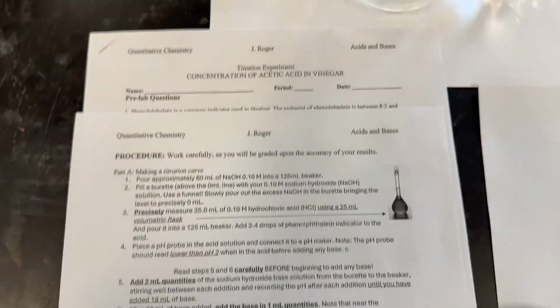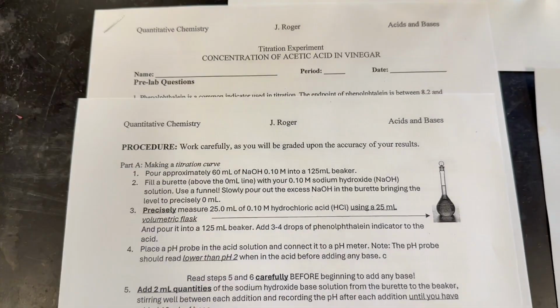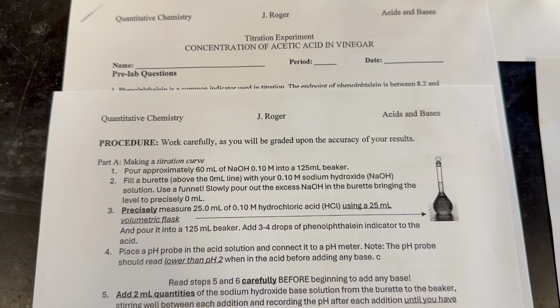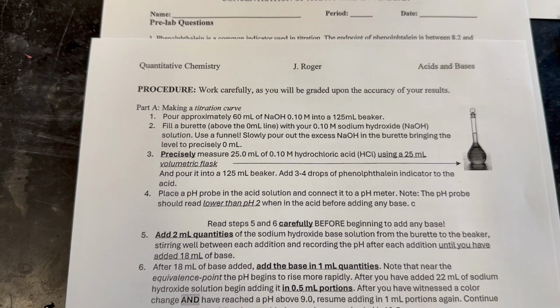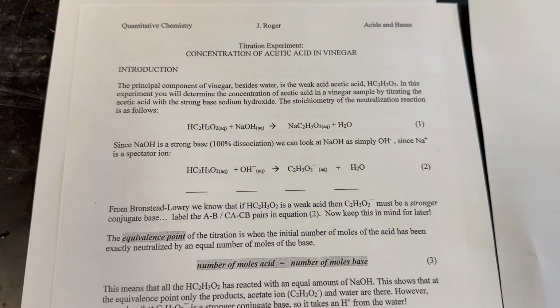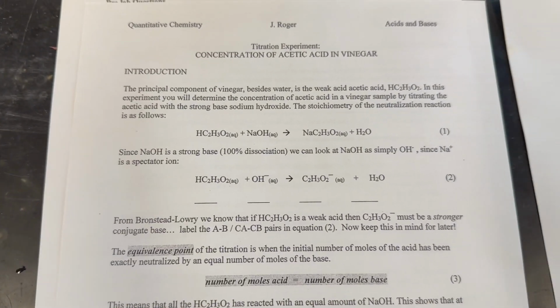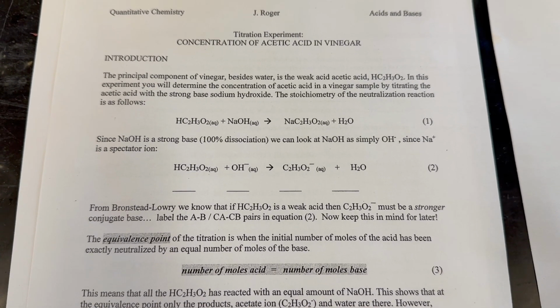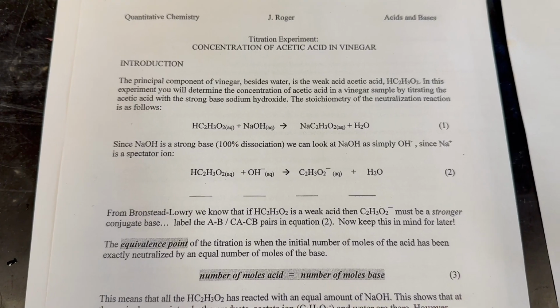So today we have a fun one. We're gonna do a titration experiment, and it's gonna have two parts. The first part is just about getting familiar with titration, what the titration curve looks like, and just a reminder on graphing in Excel.